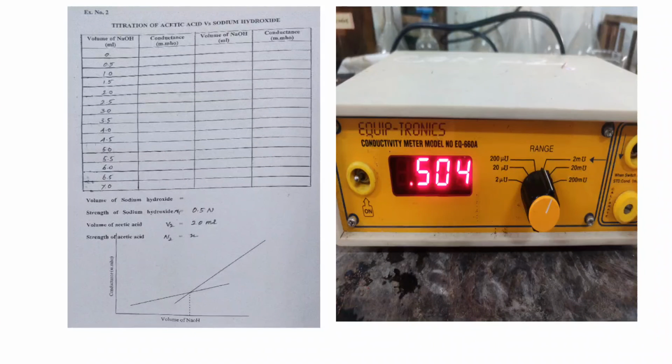So, we get the volume of sodium hydroxide from the graph, the strength of sodium hydroxide is 0.5 N, and the volume of acetic acid is 20 ml. From these values, we can calculate the strength of acetic acid present in the given solution.